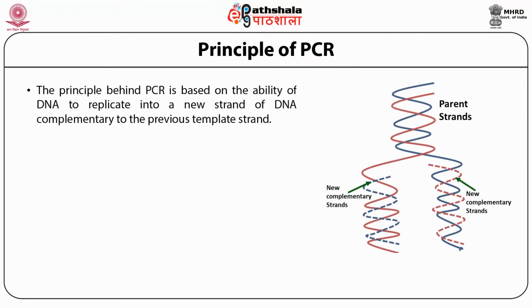The principle behind polymerase chain reaction is based on the ability of DNA to replicate into a new strand of DNA complementary to the previous template strand.